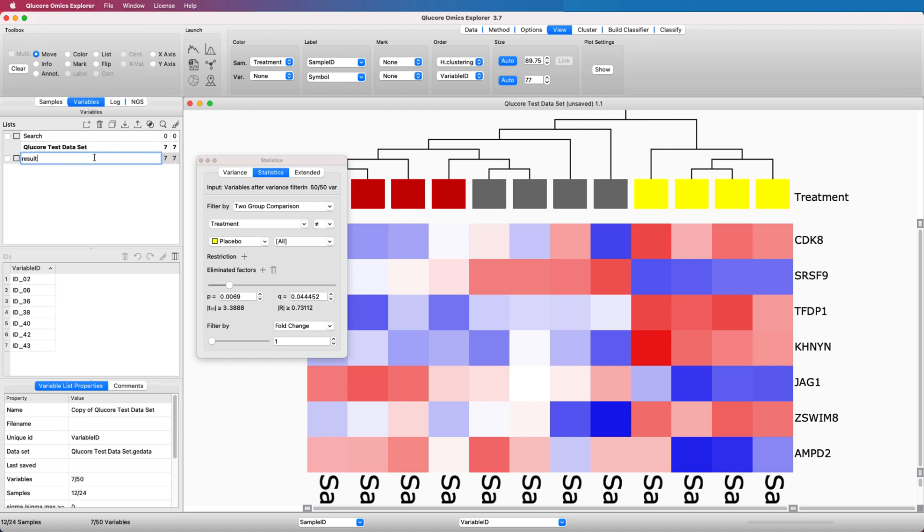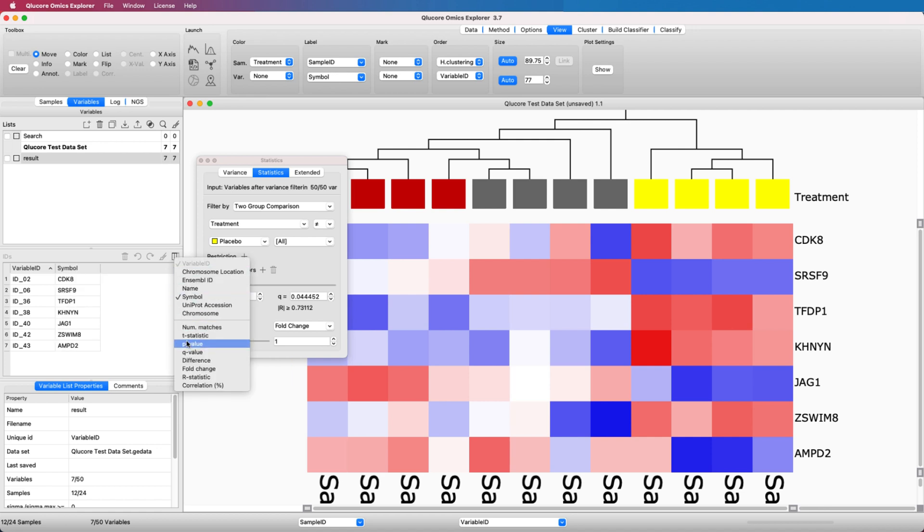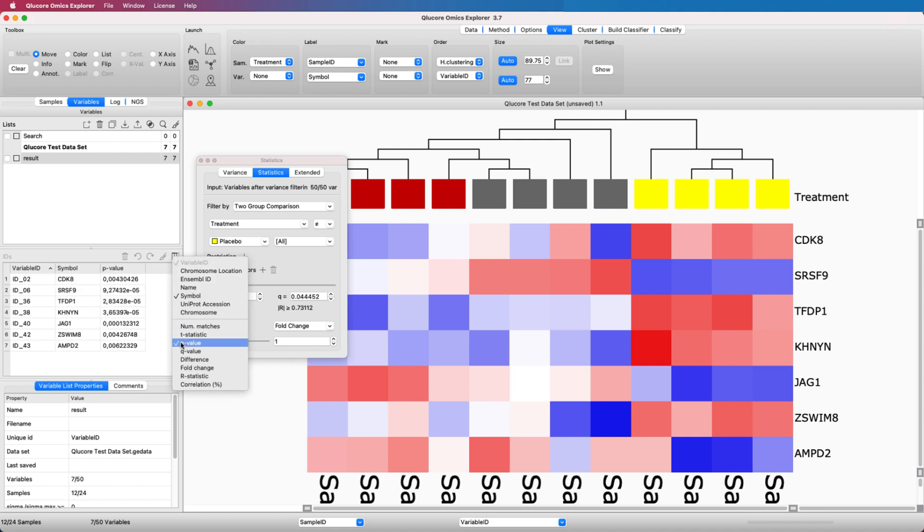To store the result, make a copy of the list and rename it. Populate the result list with relevant columns from the column selector.